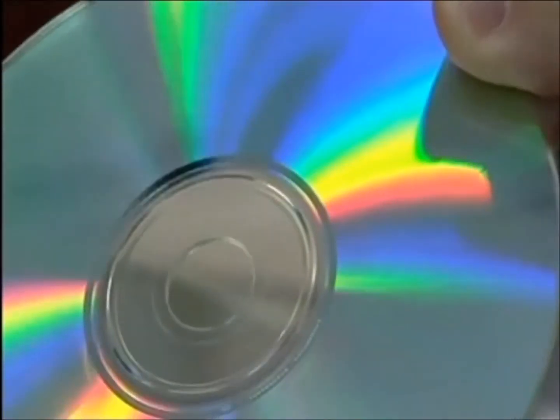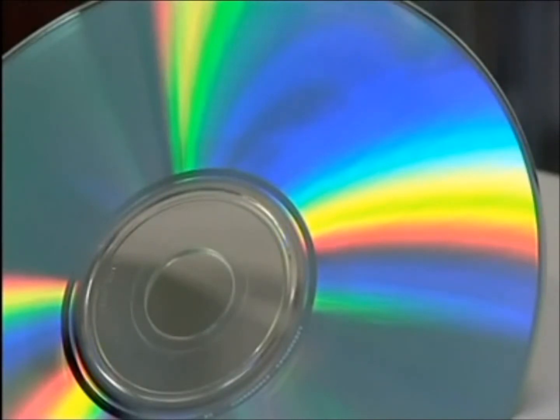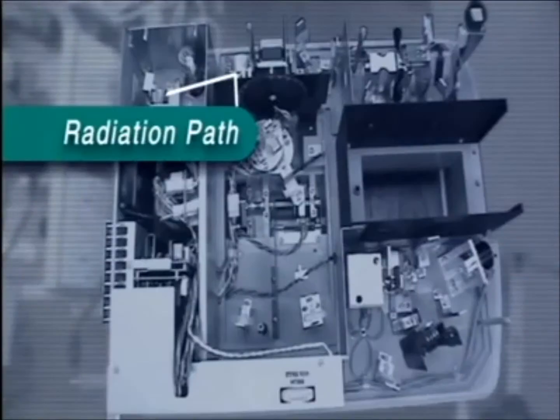constituent wavelengths. Different wavelength corresponds to different color. Red is about 700 nanometer and blue around 400 nanometer. Wavelengths shorter than 350 nanometer are called ultraviolet. Shorter wavelength light has higher energy. The source produces white light that includes all wavelength and all color.